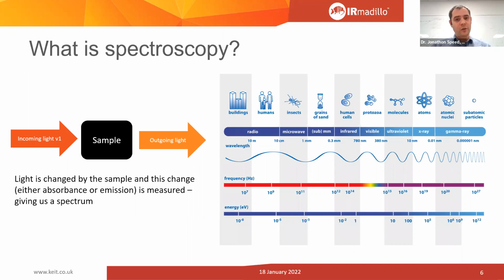What spectroscopic instruments do is turn that into full-on information, into numbers that can then be turned into concentration profiles. And we use a huge number of different wavelengths of light. This is a picture of the electromagnetic spectrum in front of us now. We can see on the left-hand side, we've got radio waves that are very, very long wavelengths, very low energy.